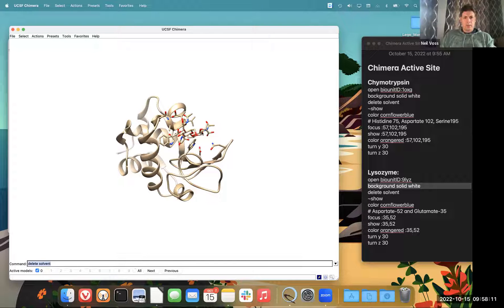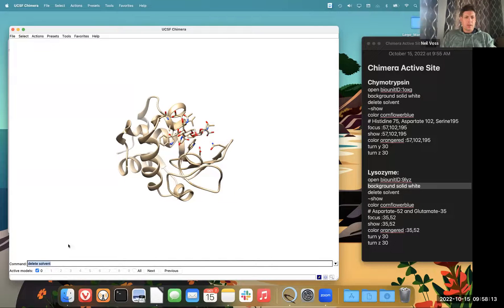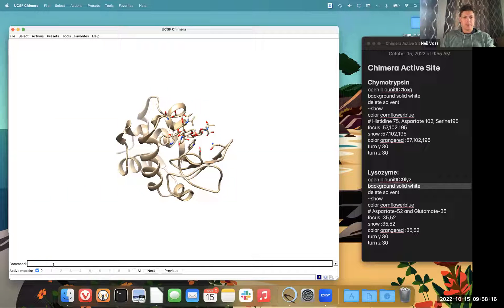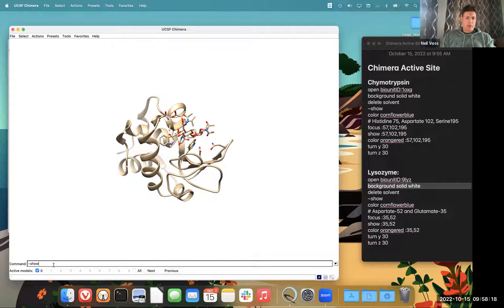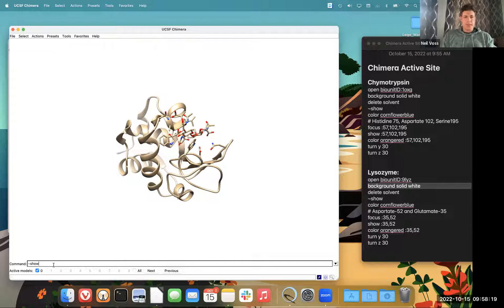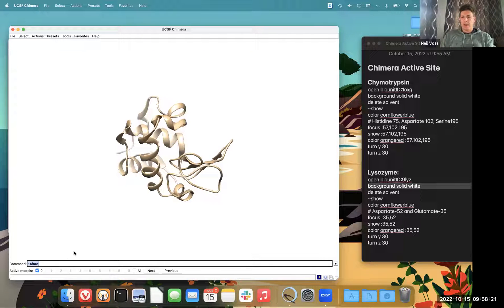We still have our custom ligands, which is not present to the students. But I'm going to do tilde and then type in show and that'll hide anything that is not protein.